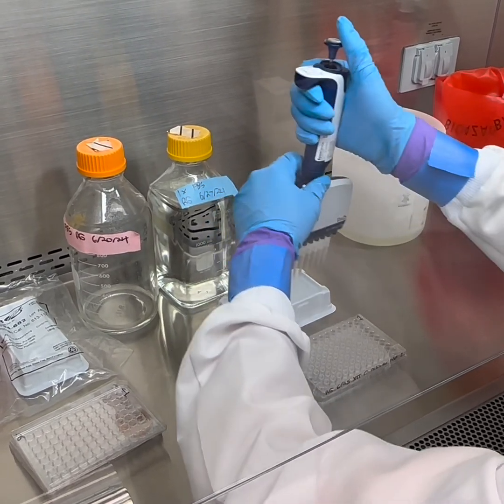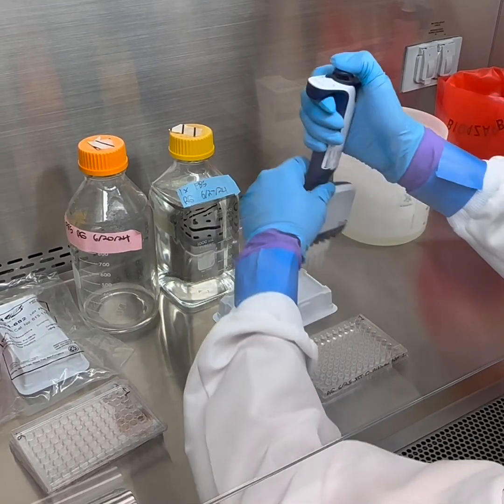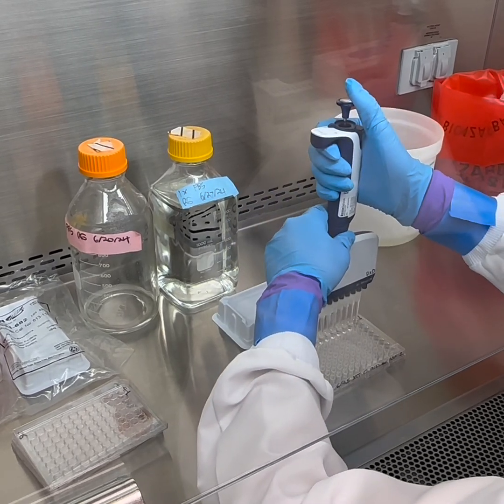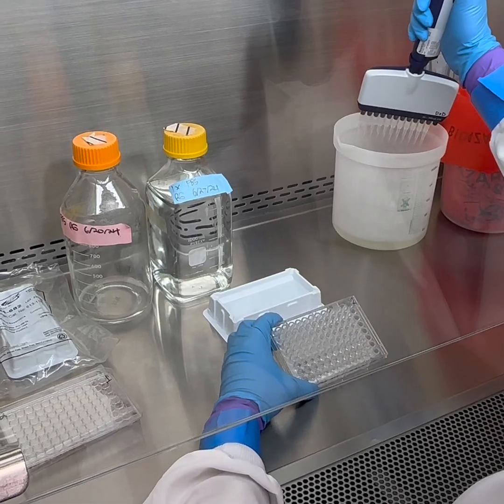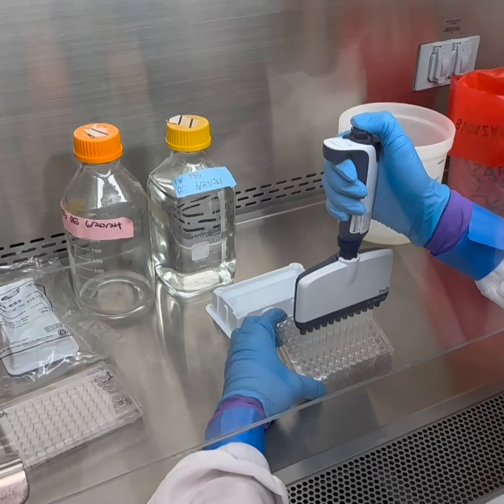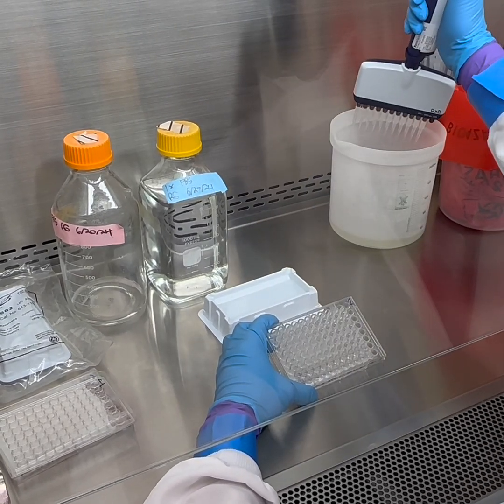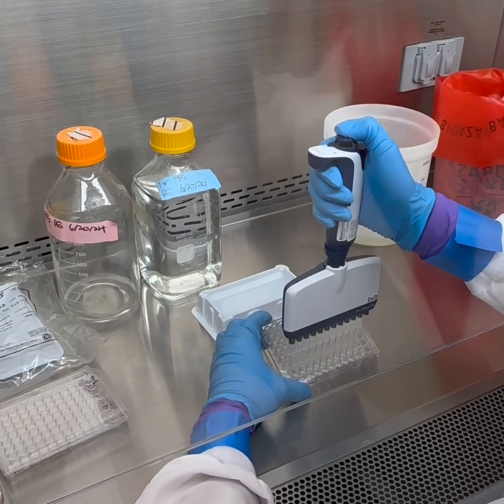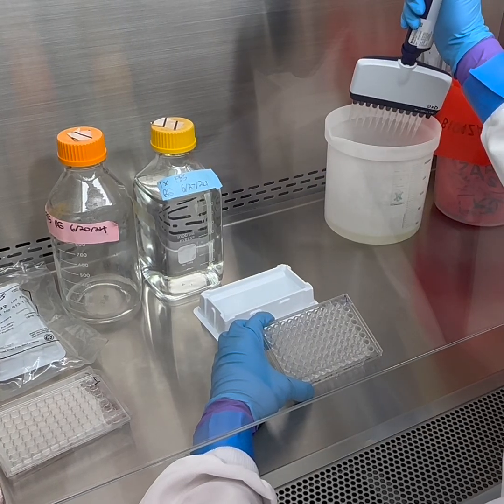We are going to add XTT to column 12. So don't forget that. XTT gets added to everything. You'll notice depending on what you eat, you might be more or less shaky. I just had a protein bar this morning, so I found that for me personally, if I eat breakfast, I'm less shaky, but some people are the opposite.